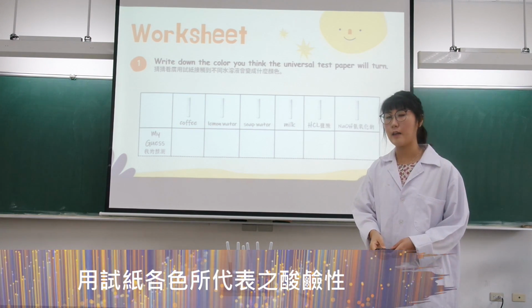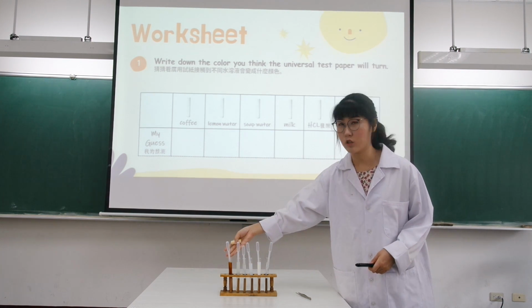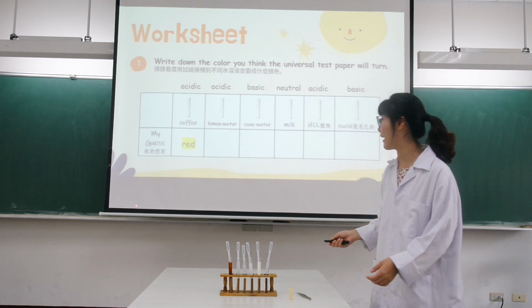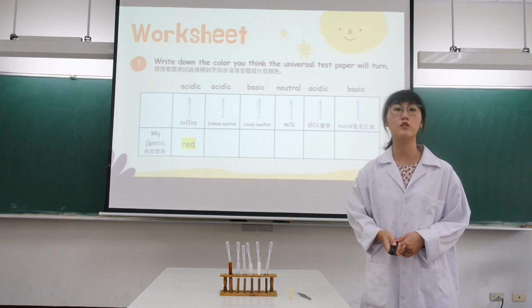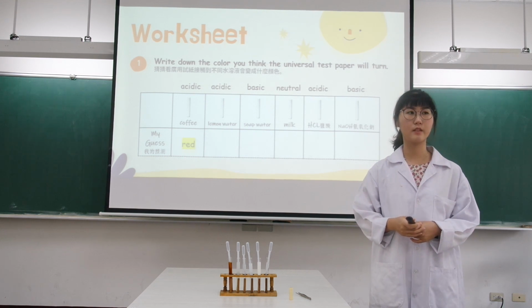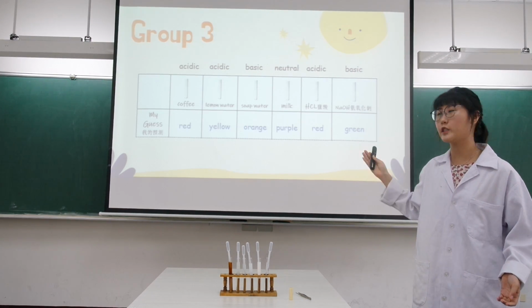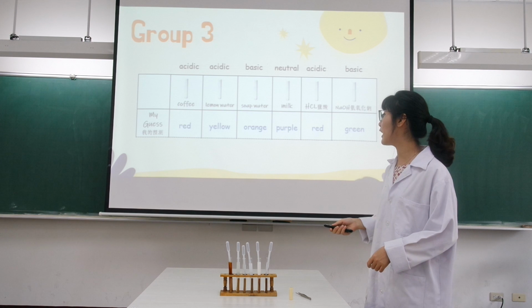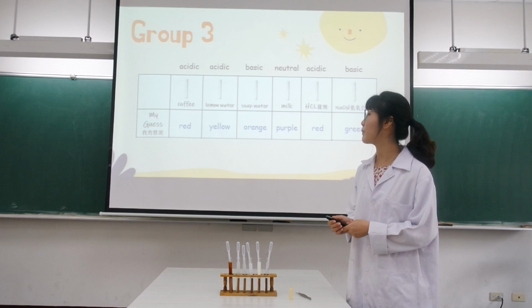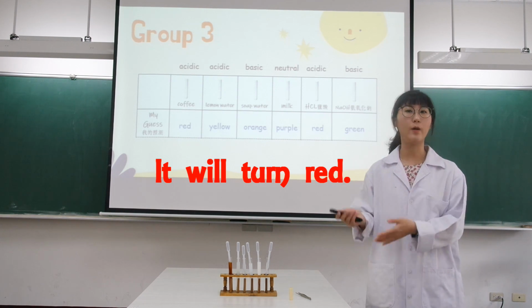So I want you to take a guess and tell me, if we use the universal test paper, write down the color you think it will turn to. Okay, I'll give you 2 minutes. Okay, very good. So let's look at Group 3's worksheet. Group 3, can you tell me if we use the universal test paper to test coffee, you think it will turn red? Very good.